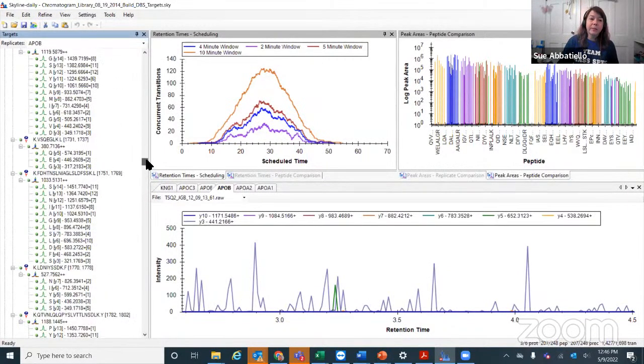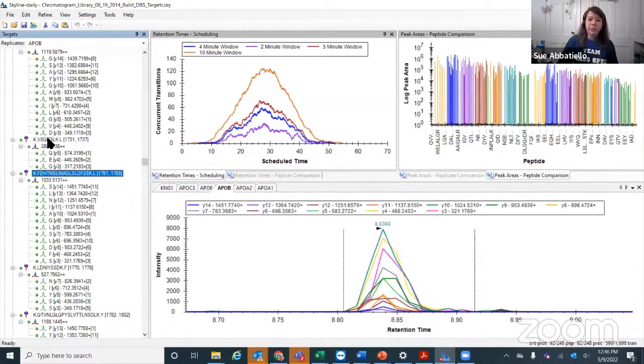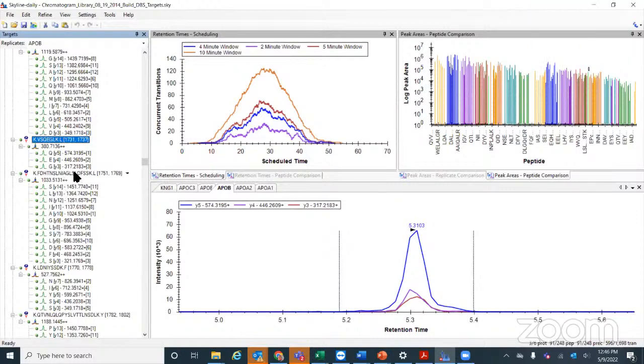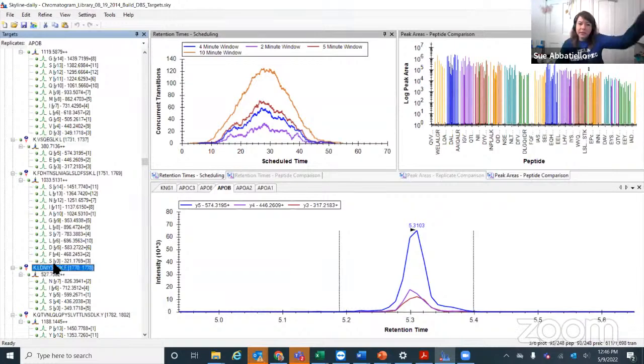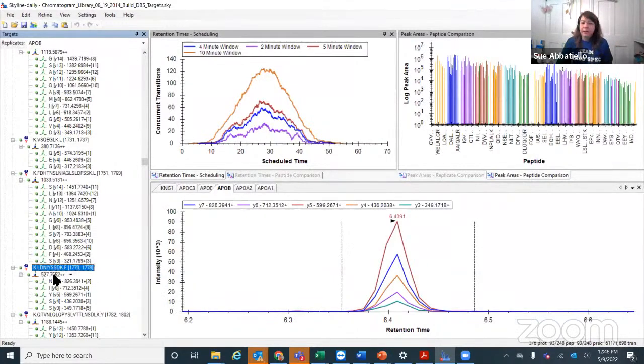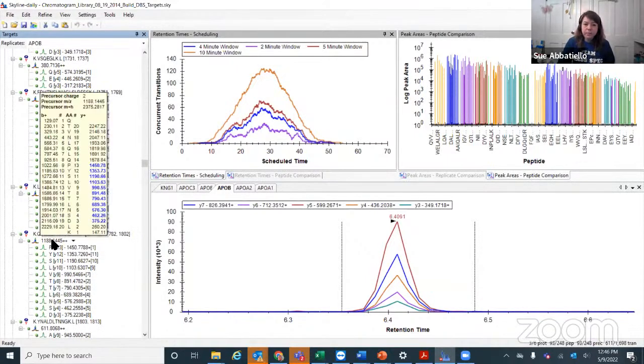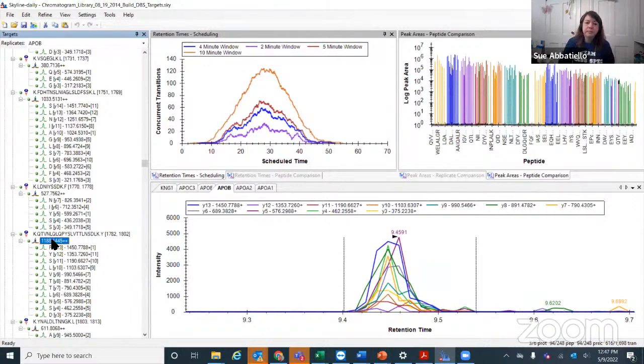Because you might have some peptides that look inherently more stable and more equally distributed, but they might not be stable after doing run to run and having them sit in your autosampler vial for a while. Whereas one that has that weird distribution of one super intense ion and the rest not, that may be your best peptide. So I don't usually axe things early unless they look horrible and there are no other backup options.